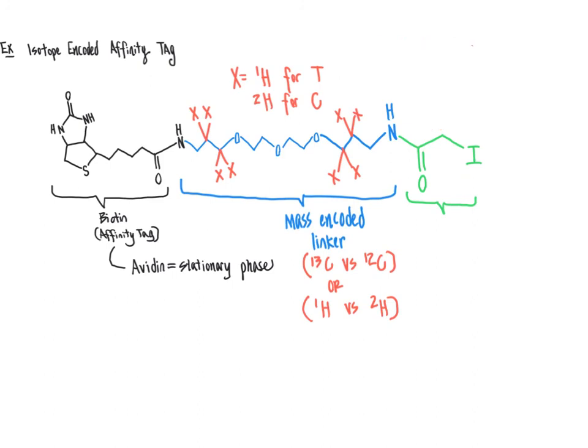Hence, if we envision that we have a cysteine residue, which I'm just going to abbreviate as our SH group with a squiggly line here representing the rest of that cysteine amino acid residue, which could be present as part of a full intact protein or a peptide, what will happen is that the sulfur atom here is going to act as the nucleophile, comes in, and forms a covalent bond to the carbon there as the leaving group leaves in an SN2 type reaction.